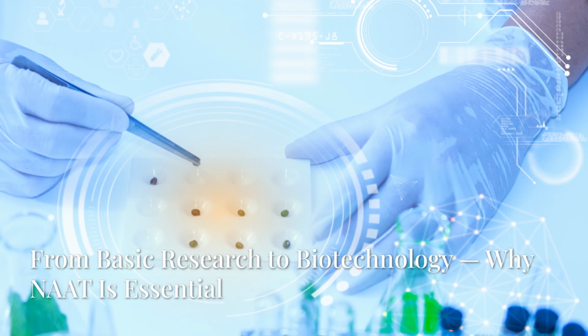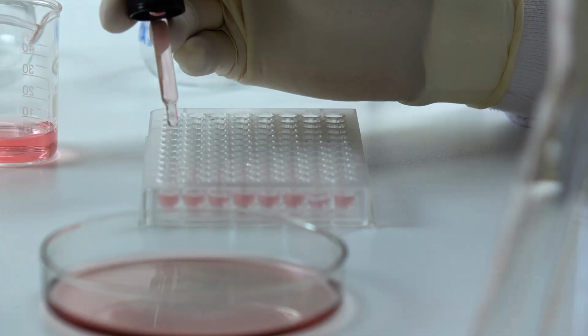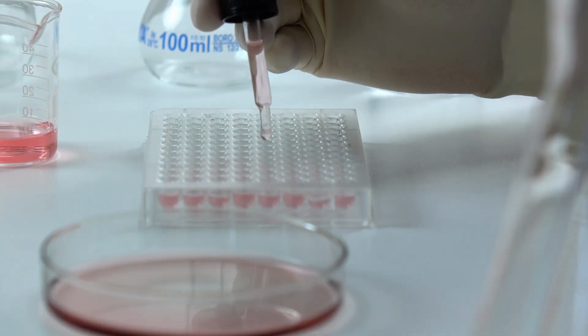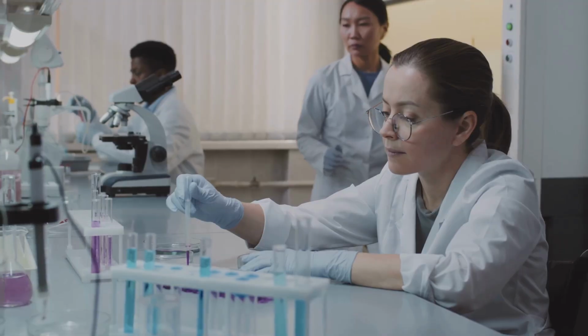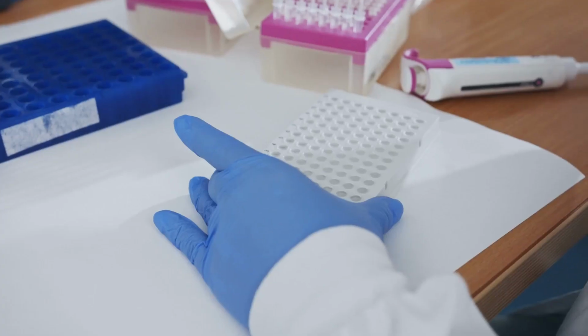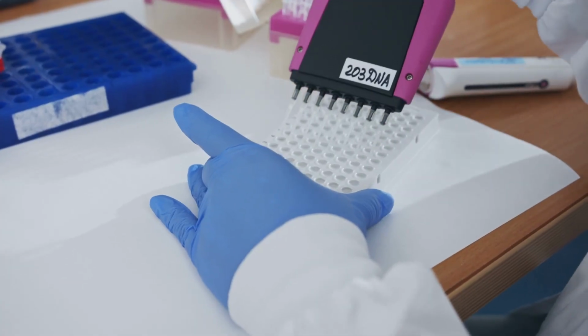From basic research to biotechnology, why NAAT is essential. NAAT isn't just a lab routine, it's a foundational technology behind gene expression studies, environmental monitoring, and advanced biotechnological innovation. Mastering this technique truly opens the door to a wide range of molecular applications.